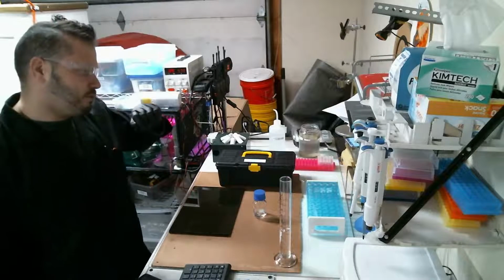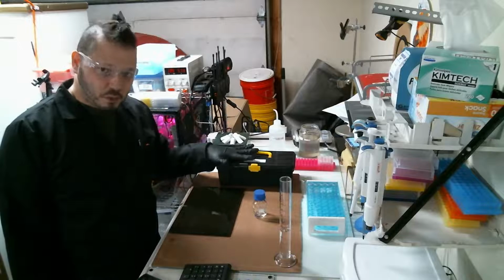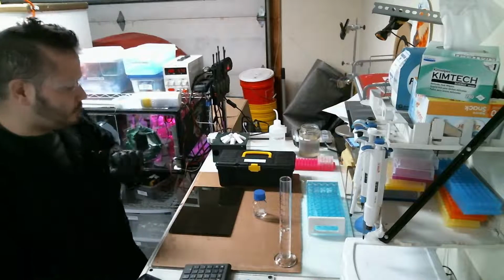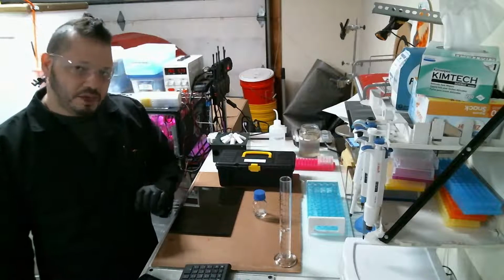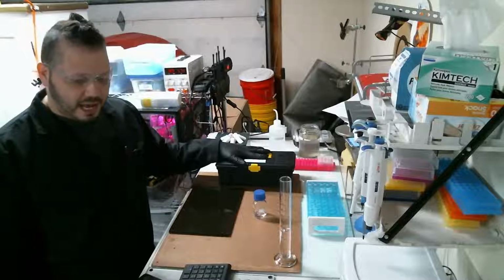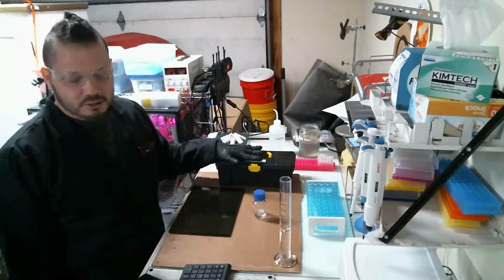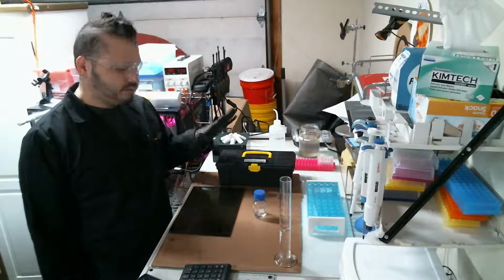But if you dilute a stock solution that you have from one concentration to a lower concentration, you can get to that lower microgram level. For right now, I currently have indole acetic acid stock solution at 0.285 molar concentration.